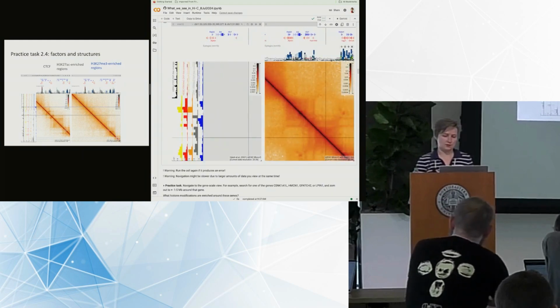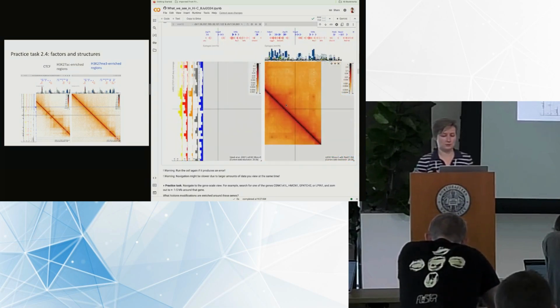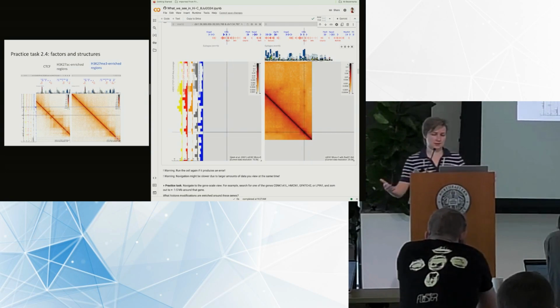And you can see some of the regions are just general heterochromatin or not annotated, but some of the regions might be active transcription start sites, or enhancers. So if you hover over it, ideally it should tell you what is the type of chromatin associated with this particular region. And this is super helpful because you need to analyze much less data, you comprehend it much more easily.